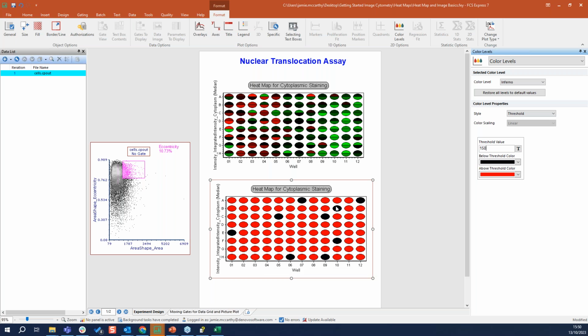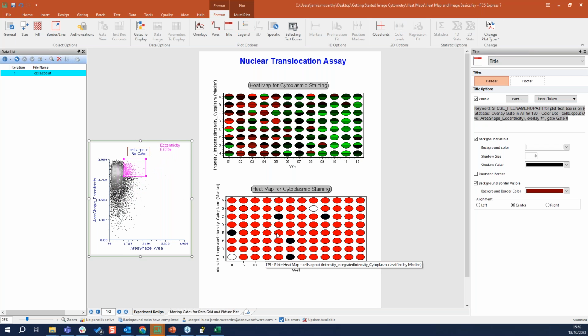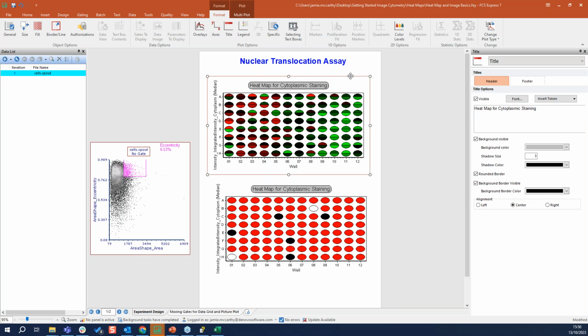Here you can scan all of your data really easily, and you just get to know on-off. And maybe these black wells are the ones which we would take forward, that were of interest to us to dive a little bit more deeply into. You can see all of this live updates based on whatever you're looking at. So this can be a really nice way, if you're just scanning data, to get a quick answer, putting these thresholds in.